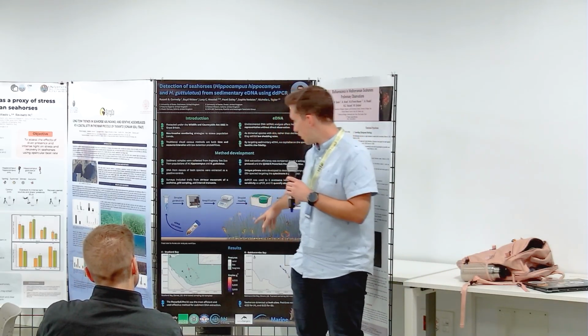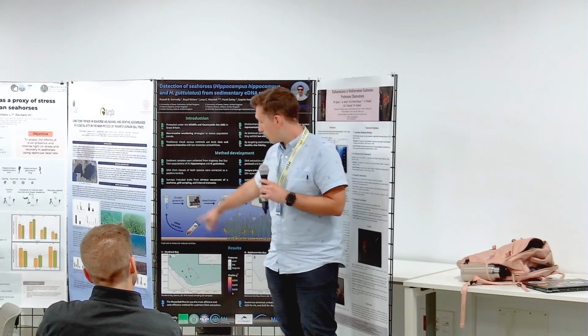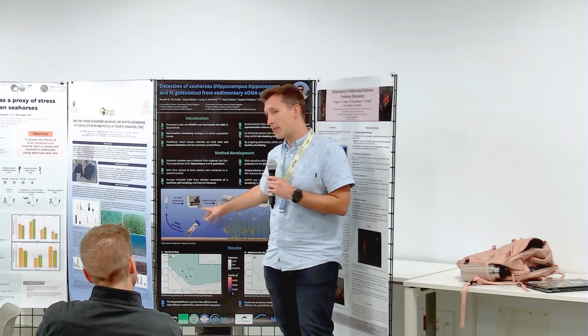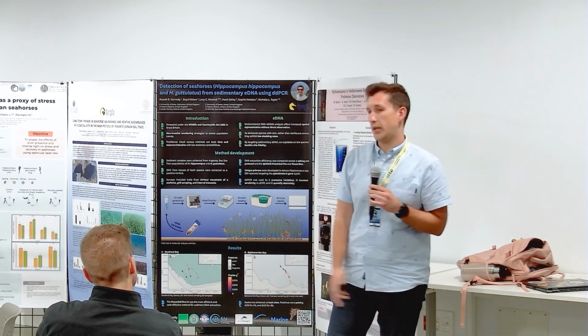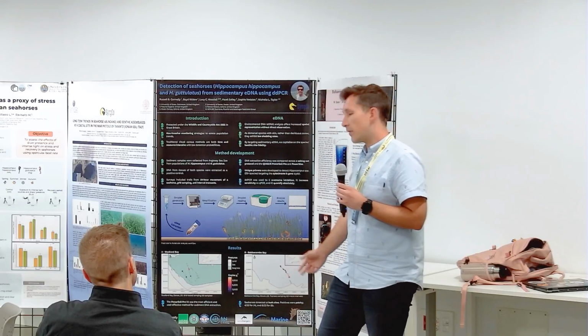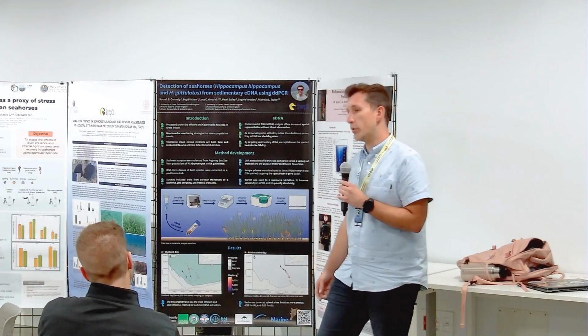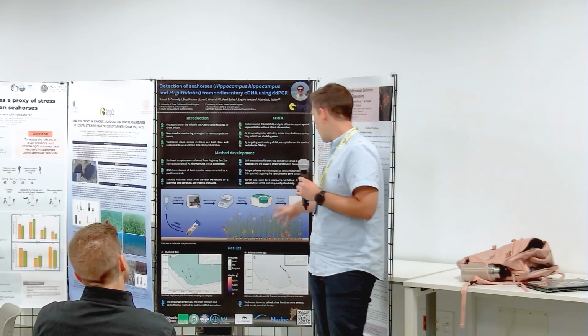As you can see here, we collect the sediment from the environment, extract the DNA, and create 20,000 nanodroplets. So essentially that is creating the needle in a haystack scenario. Even if one or two of the potential droplets are positive, we are then able to detect the seahorse within that. You then read that and analyze the results.